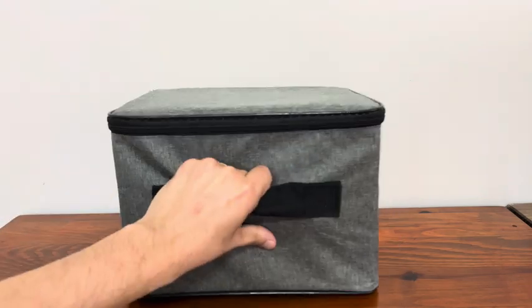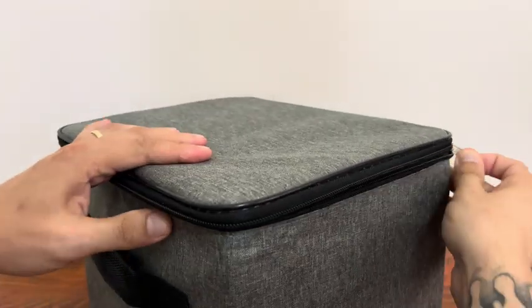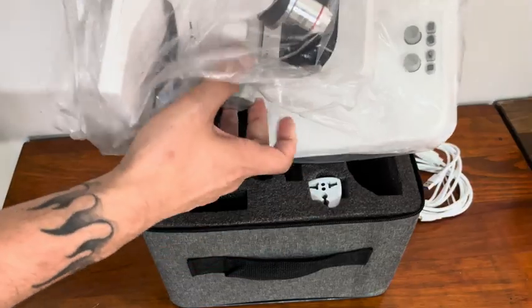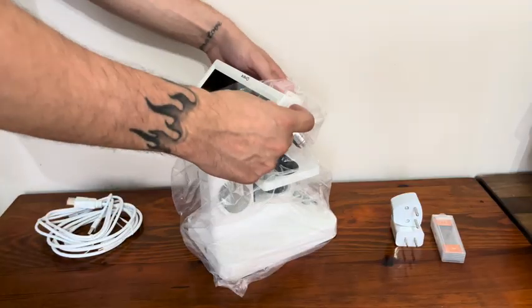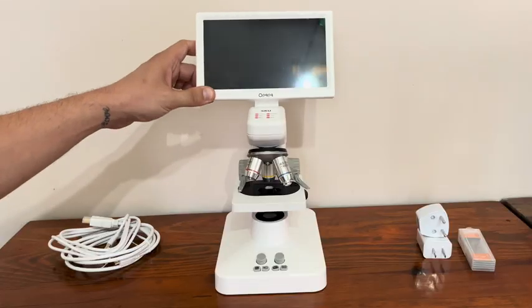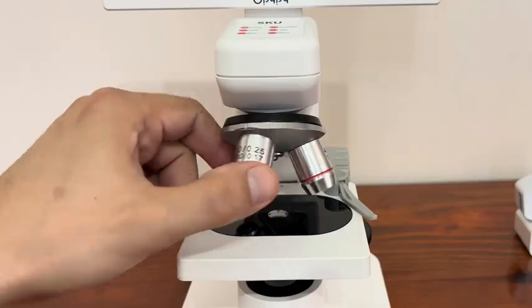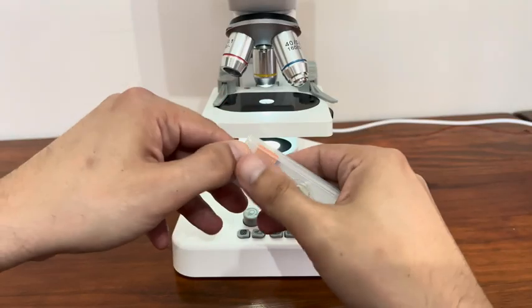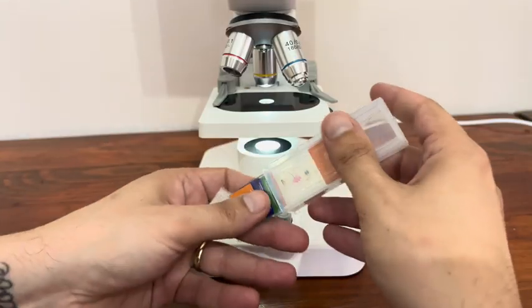The microscope came in a nice case. With its rechargeable and wireless functionality, I'll be taking it with me on my nature trips. It has everything I need inside, so I don't need to purchase anything extra. The microscope has video and photo-capturing features, and I can transfer the videos to my phone using the memory card. I can connect it wirelessly to the modem and stream the display to my phone and TV through its mobile app. I really like these features.